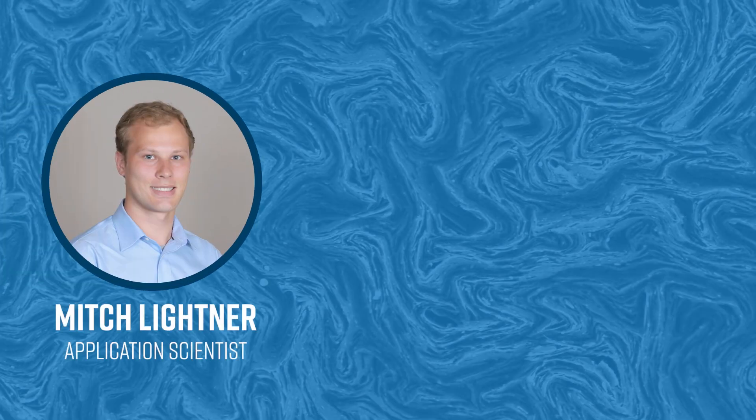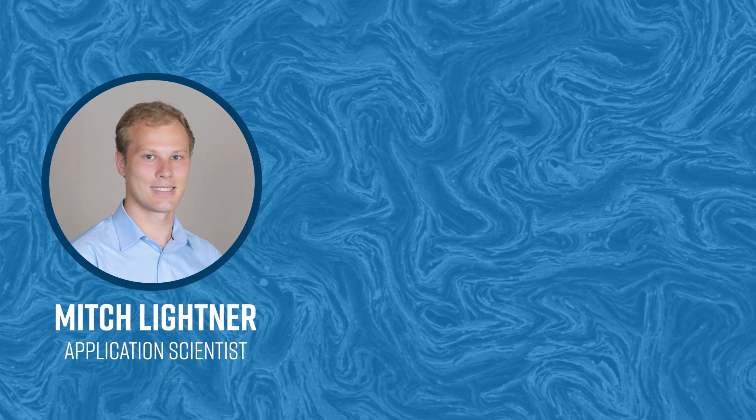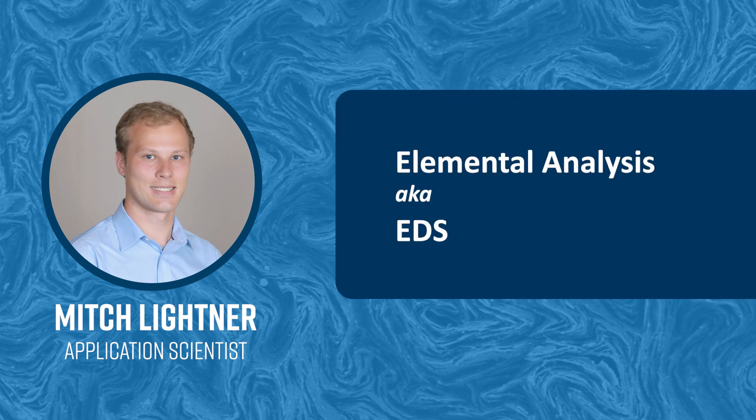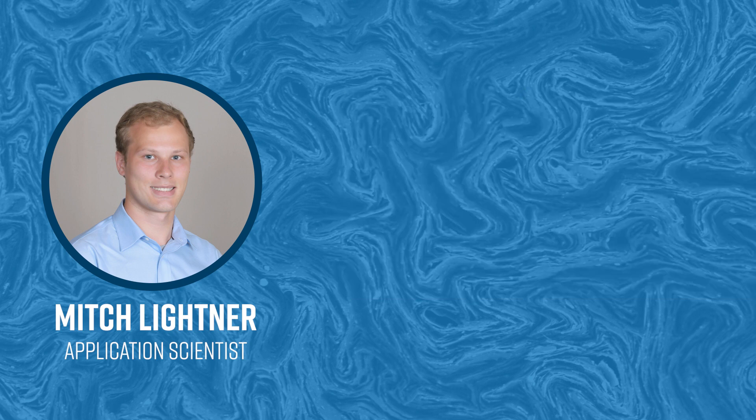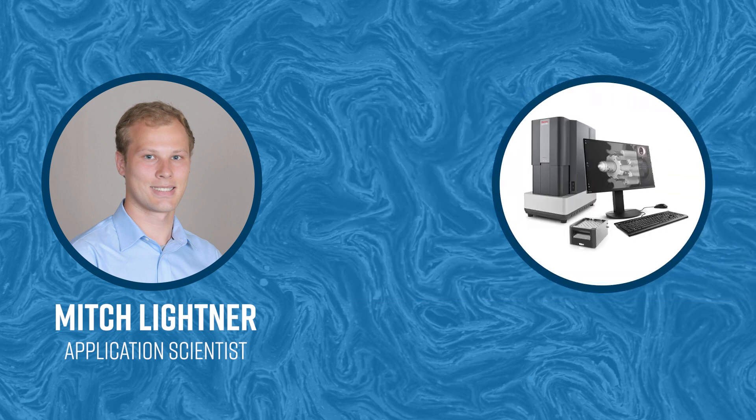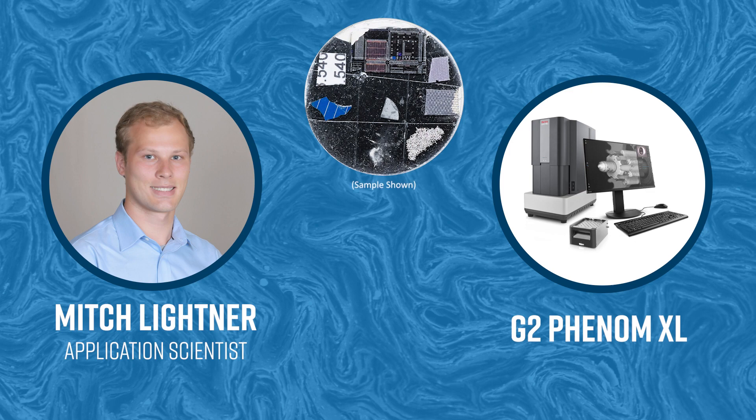Hi everyone, my name is Mitch Leitner and I am an application scientist with nanoscience instruments. Today I will be walking through the elemental analysis technique known as EDS and its basic capabilities within the Phenom SEM. I will be demonstrating on the G2 Phenom XL, but these methods work on any Phenom SEM.